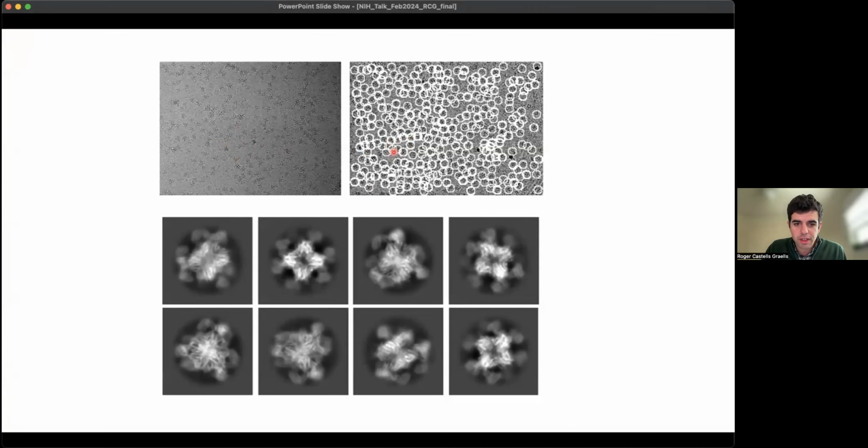And we pick the particles, and now here you can see when we do the classification of the particles, you can see now the 2D projections, which we call 2D classes. What you can see is that for the protein cage, we can already see secondary structural features, like, for example, these tubes here that would correspond to the helices. And the exciting thing is that you could already even see features and the density for the GFP, this 26 kilodalton protein attached on top of the scaffold.